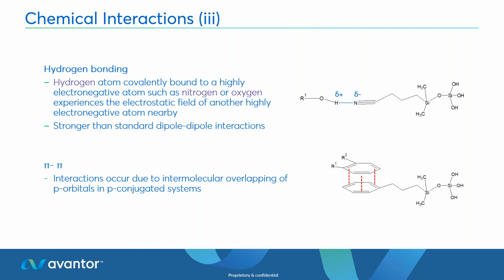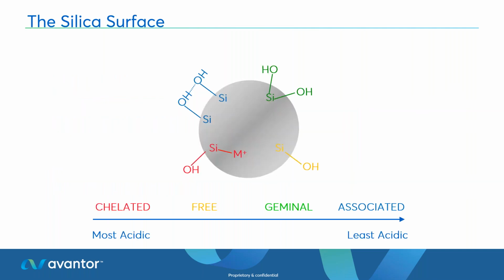So if you go back to basics, how we're manufacturing these columns, predominantly, most of us have silica-based columns. So on top of a silica particle, you have these residual silanols. And these are fantastic because it's what we bond to when we want to add that C18 chain.